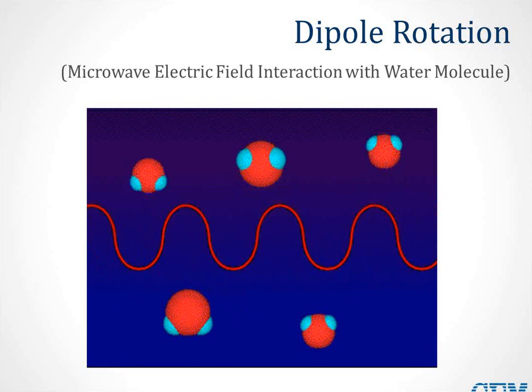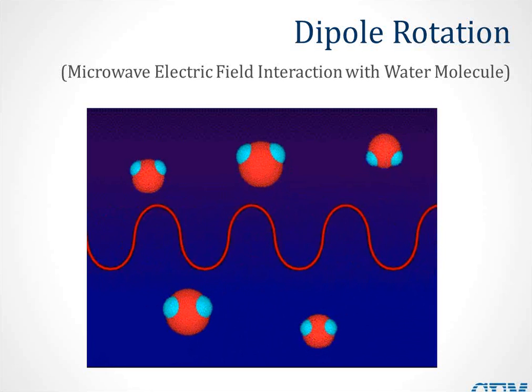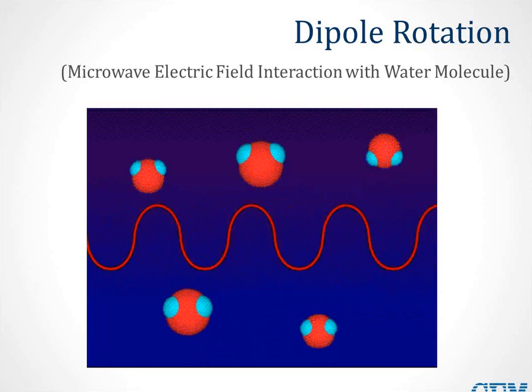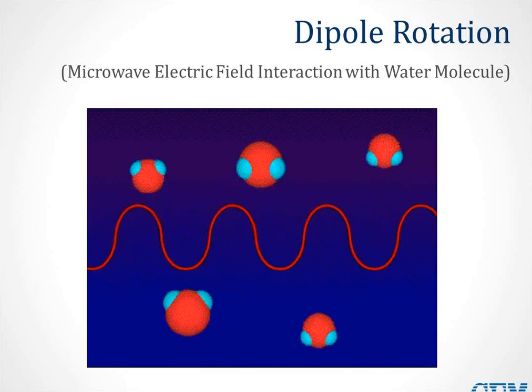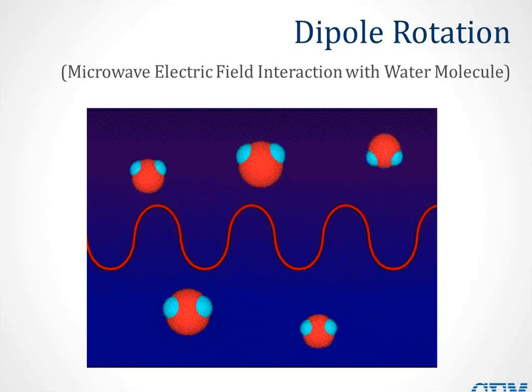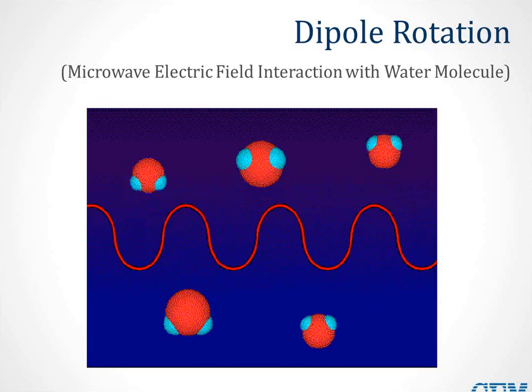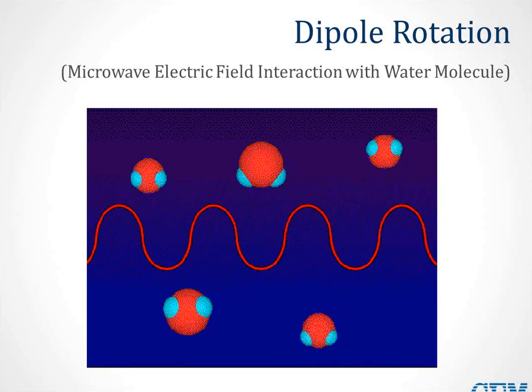Now, if you remember, I mentioned the disruptive characteristics of microwave energy. So this is one way it's disruptive: every nanosecond there's another microwave coming through. So instead of that water molecule being able to truly track that electric field, as it's tracking, another microwave comes through, causing it to realign itself, and then causing essentially what you see here, like this wobble effect. So basically, this wobbling, this kinetic energy, is what gets translated into heat, and that's how we heat our samples. Now, ionic conduction is very similar. Instead of having your dipole moments aligning themselves with that passing electric field, you can imagine that if we had ions in the sample, we'd be doing the same thing.